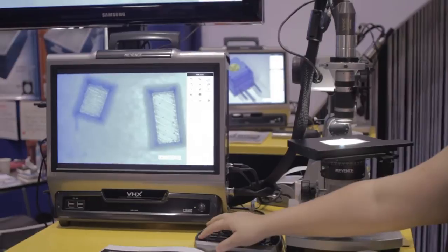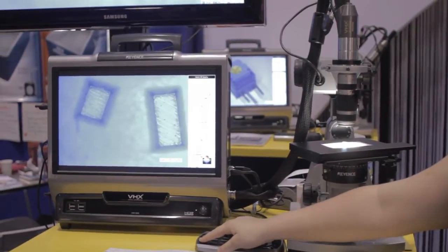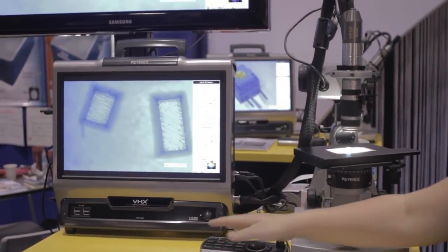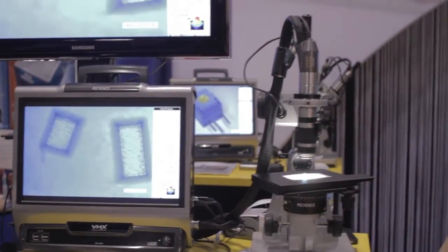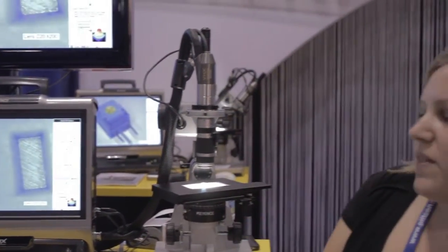Now your traditional optical system will be able to give you either of those two images. But what the VHX-1000 has is a function to overcome that depth of field limitation at those higher magnifications.